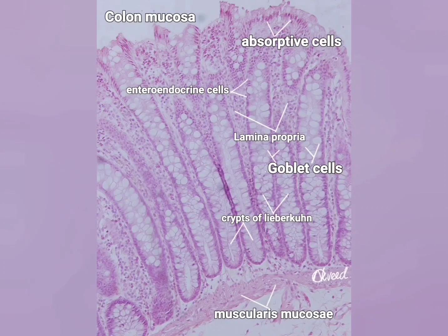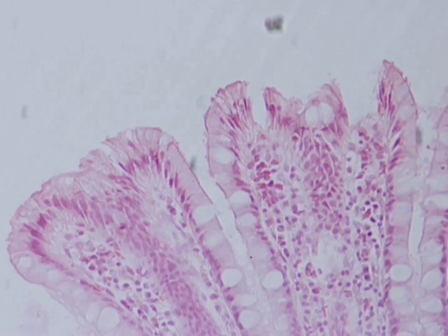The lamina propria is fine connective tissue and it contains diffusely spread lymphocytes as well as lymphoid nodules. The muscularis mucosa is a thin layer of smooth muscles consisting of an inner circular and outer longitudinal layer.